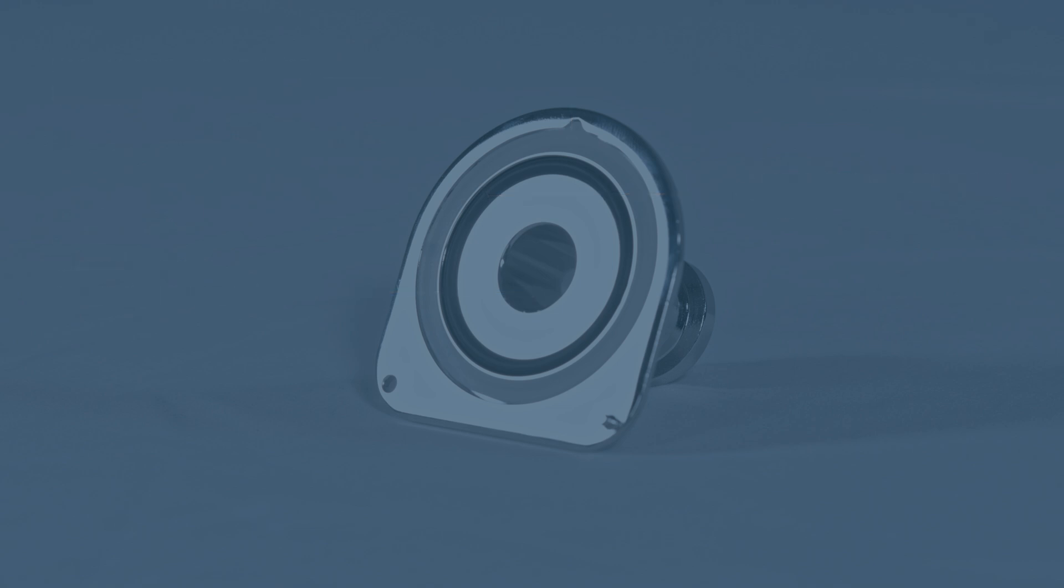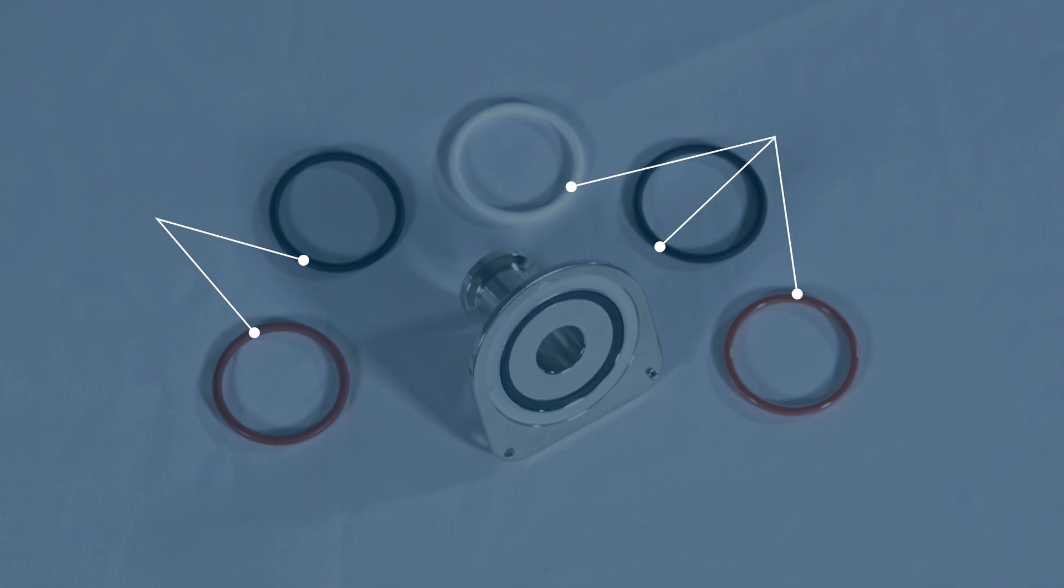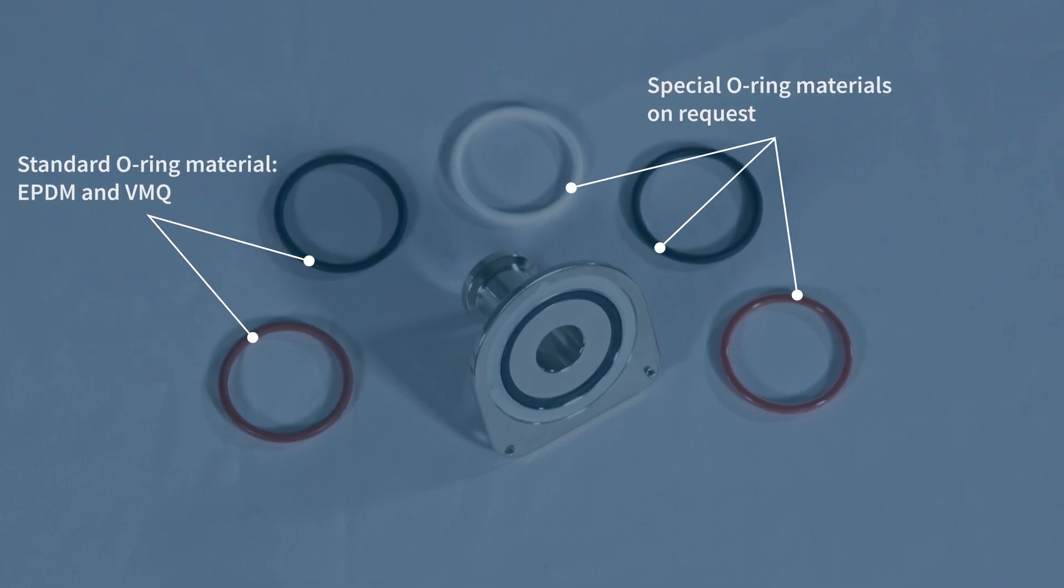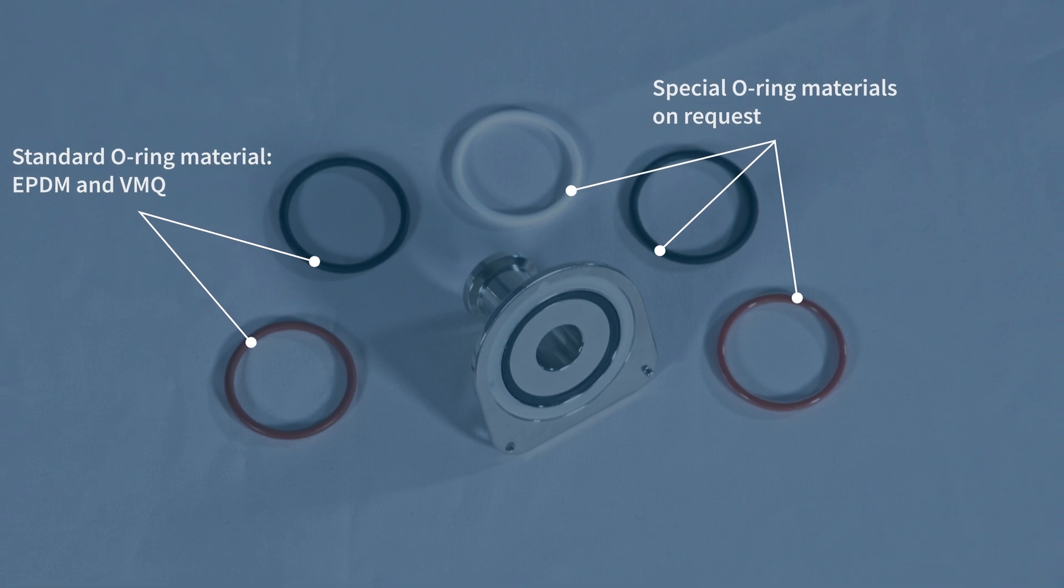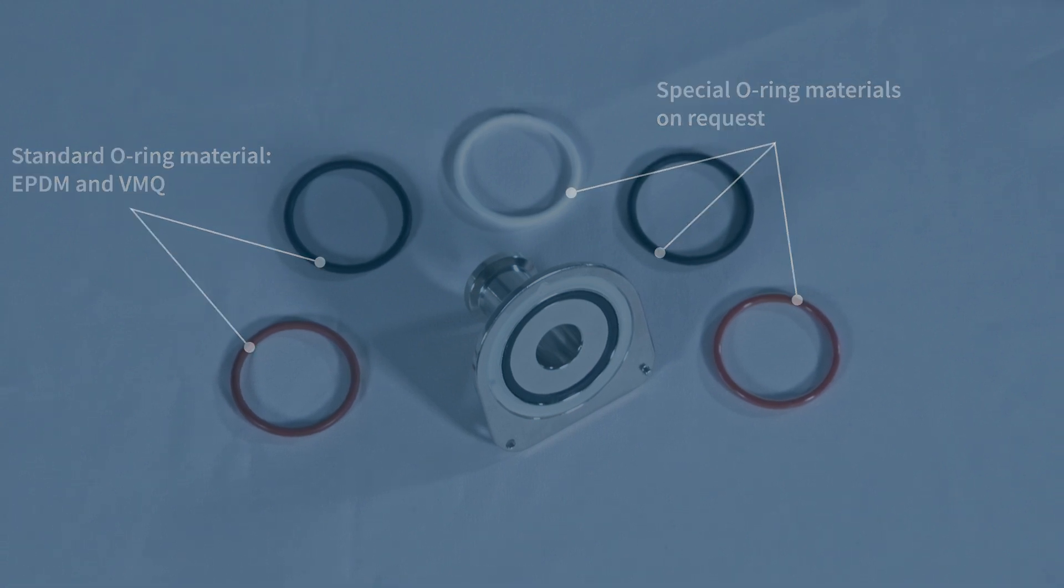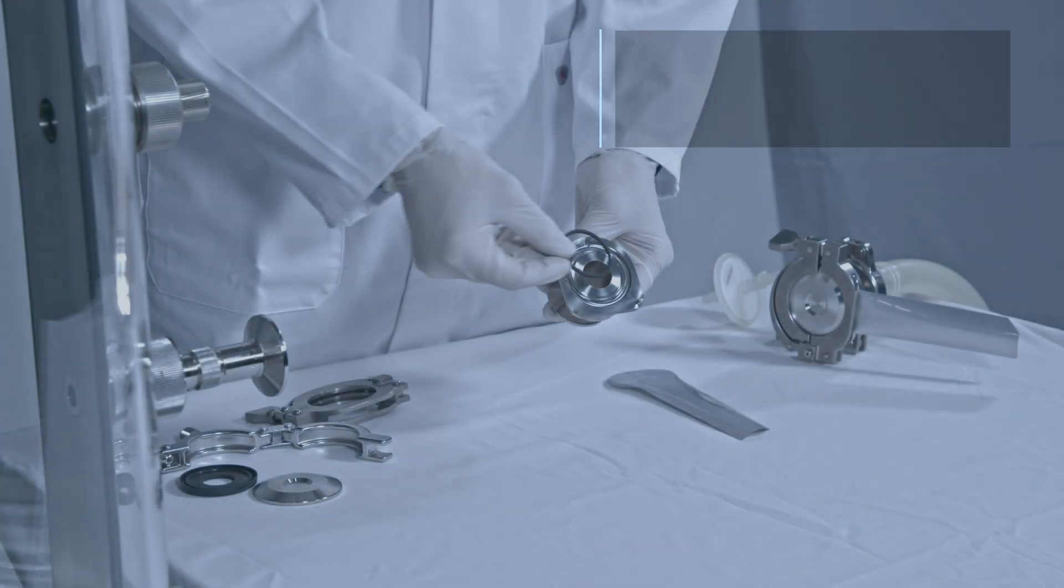standards of the pharmaceutical and food industries, minimizing the risk of contamination during connection. A ready to use system in various connection sizes which can be tailored to meet your specific requirements.